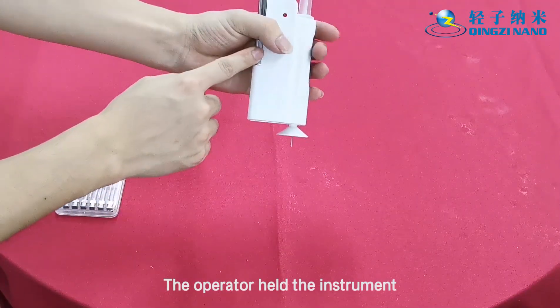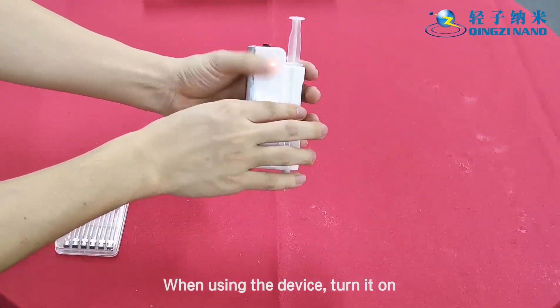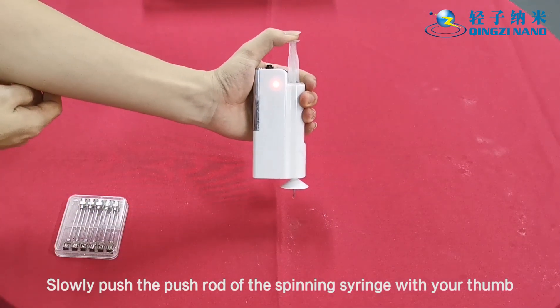The operator holds the instrument and keeps it at a certain distance from the receiving end. When using the device, turn it on — the red light will stay on. Slowly push the push rod of the spinning syringe with your thumb.